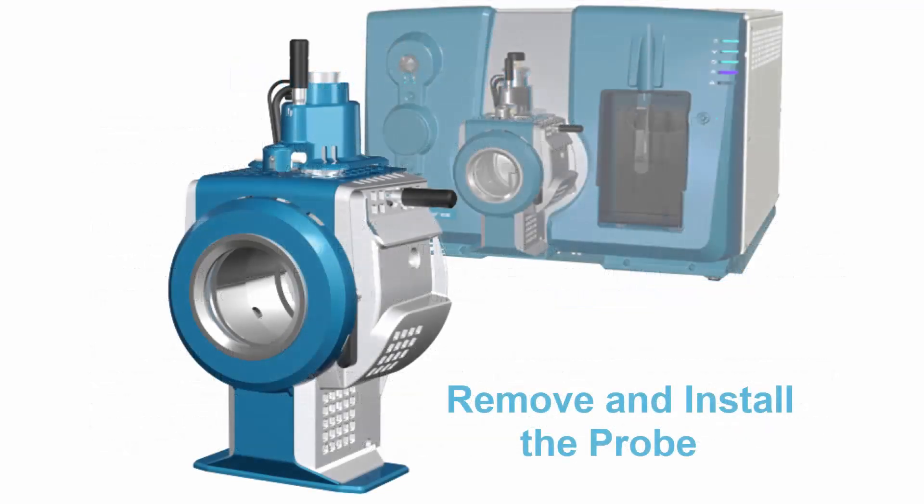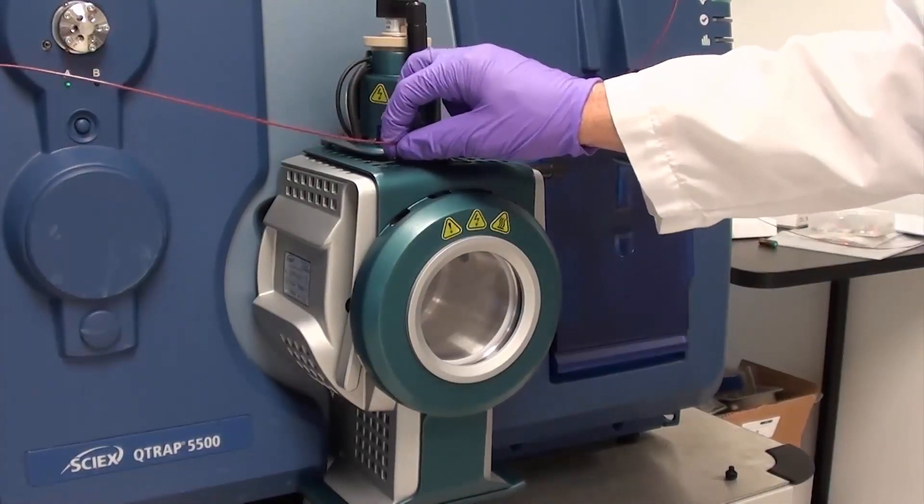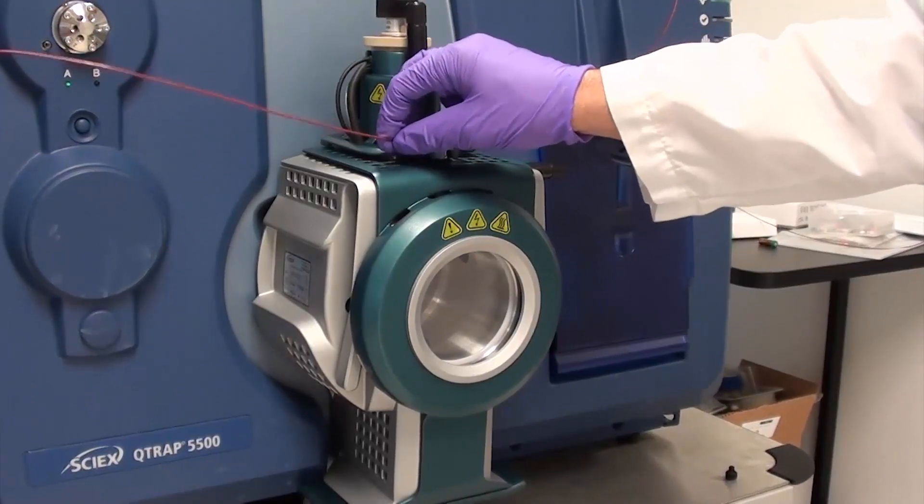This video will show you how to remove and install the probe for the ion source. To remove the probe, remove the ion source from the mass spectrometer and loosen the sample tubing nut.